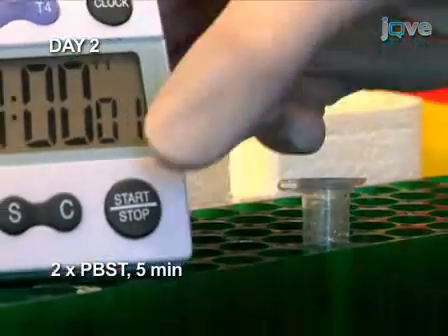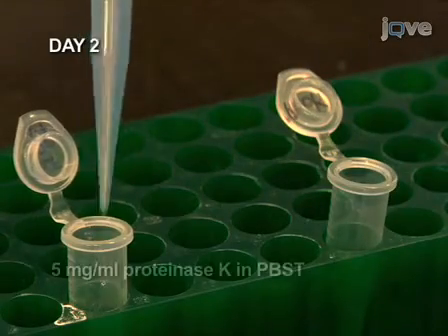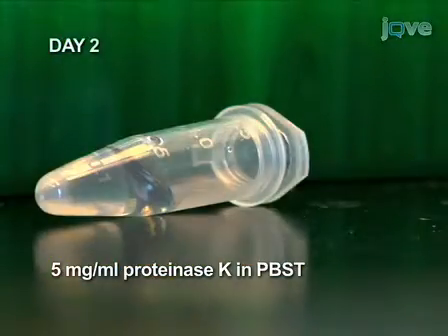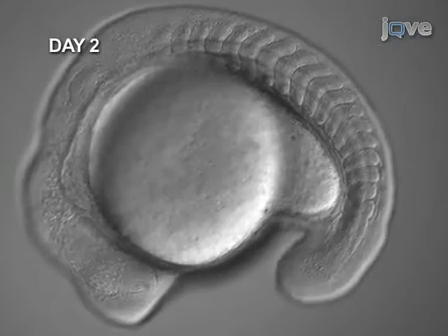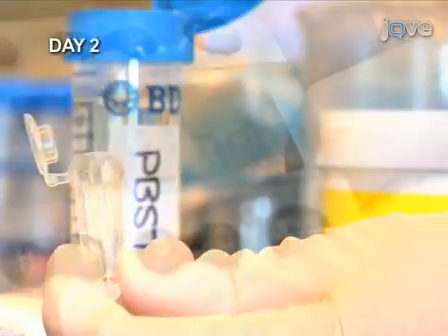We are now ready to permeabilize the embryos. The fixed embryos are permeabilized by incubating them with proteinase K. Make sure to lay the microcentrifuge tube on its side. The length of the digestion step depends on the age of the embryo; for example, somitogenesis stage embryos are incubated for 3 to 4 minutes. Rinse briefly in PBST and wash once in PBST for 5 minutes.